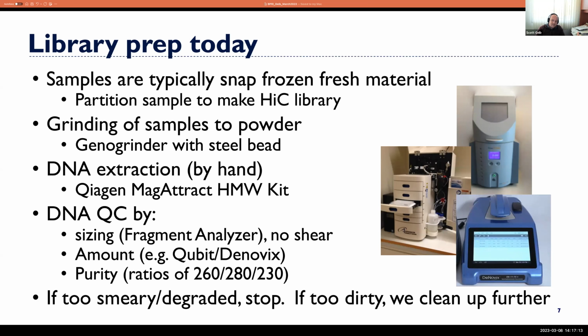All of these things, the sequencing is expensive, right? And so if you give it to your core lab and they go and sequence it, you want to make sure you're giving them the best thing. They'll often just proceed with whatever you give them. And so you can't be mad at them if they give you a fifth of what you were expecting if you're giving them degraded DNA, dirty DNA, whatever.